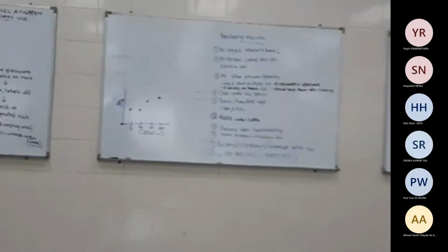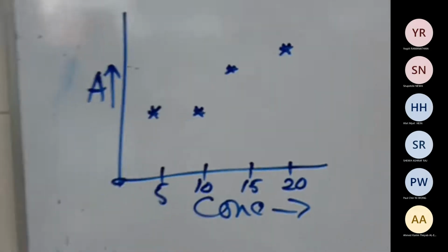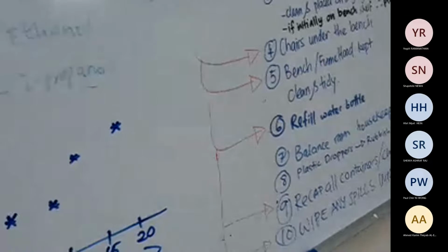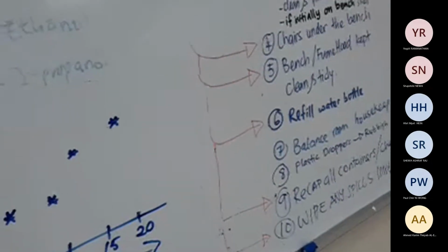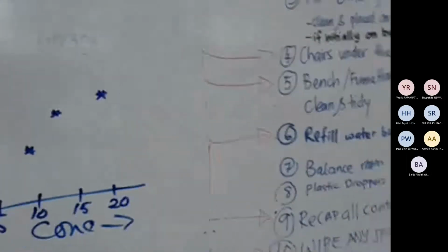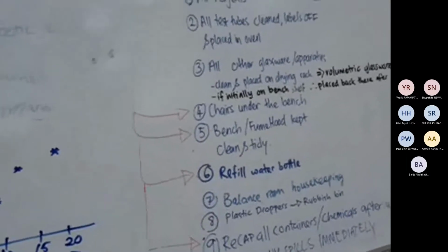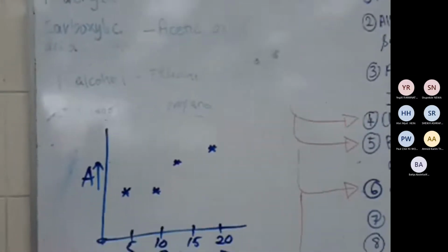So I bring it close probably for the online students. What I'm doing is, this is the concentration I'm making for the calibration curve. See, they cannot see. Why? What happened? Can you hear now? Hello, can you hear? Yes, sir. Okay, thank you for unmuting and talking, otherwise it's difficult for me. So this is the calibration curve. This is how you produce the calibration curve.